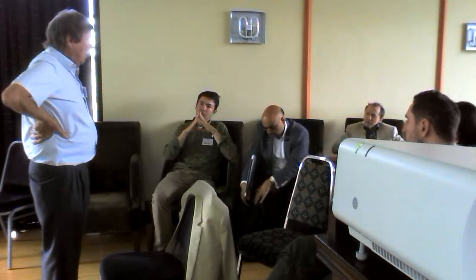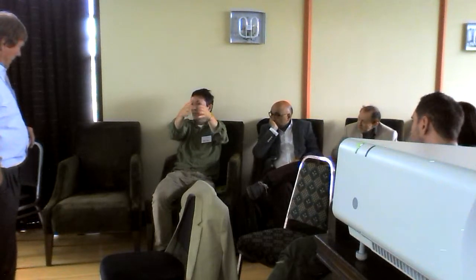Yeah. So the Fourier transform of that is still limited by the aperture of the lens that you produce the spot with. Maybe there's some clever thing we can come up with. But I think the point there is that the illumination is still diffraction limited. Yeah. But the method of producing an image somehow gets around that. It doesn't quite defeat it, but, you know.